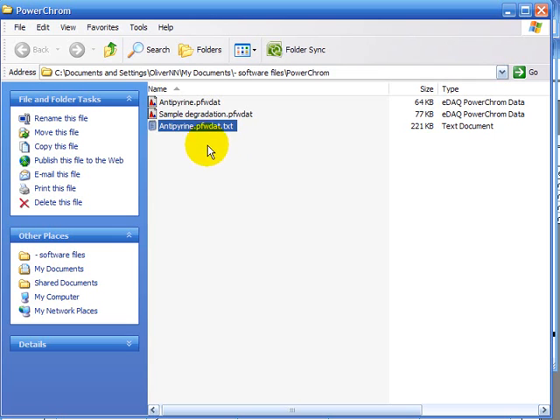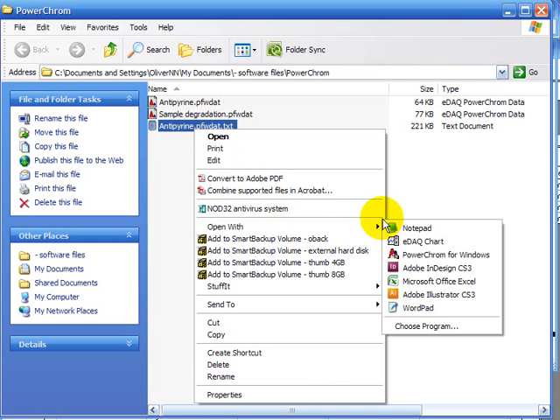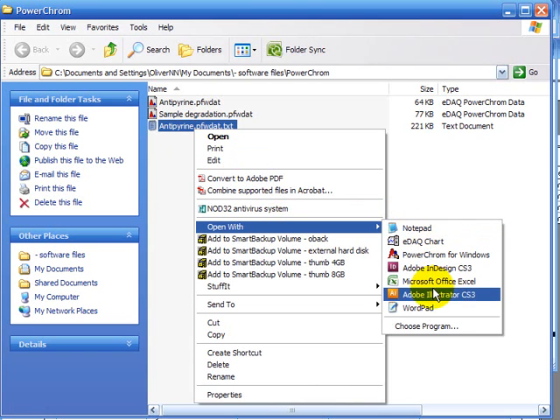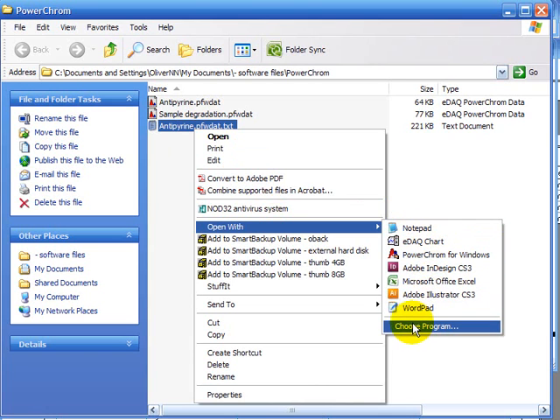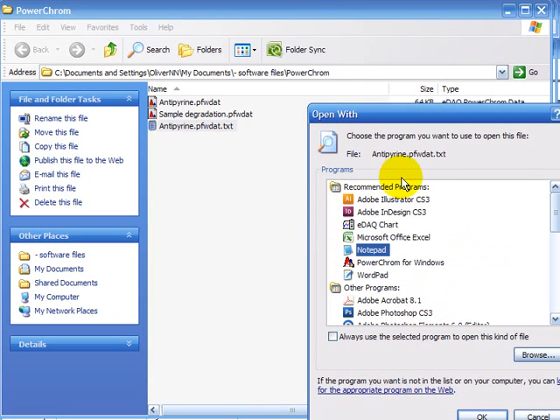What I want to do is use the mouse to right click on here. I'm going to open with EDAC chart. If this option isn't in your list, you can choose program and find it in this list instead. EDAC chart. Click OK.